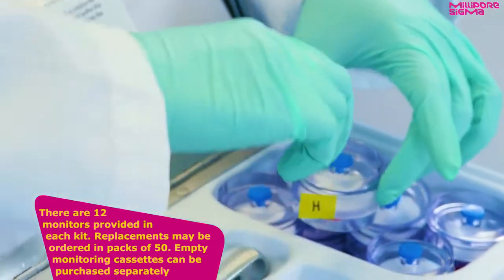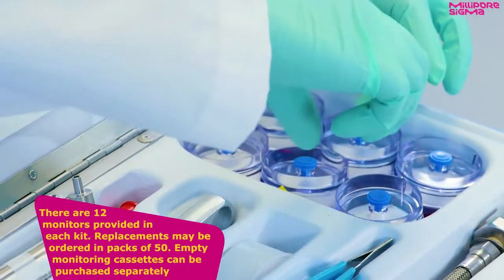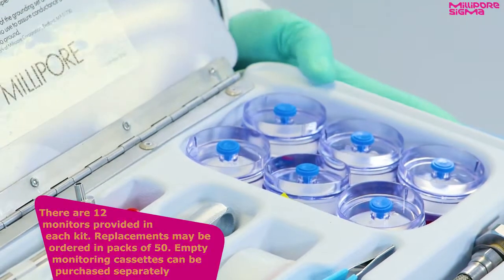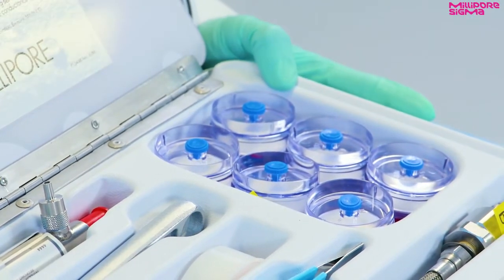Replacements may be ordered in packs of 50. Empty monitoring cassettes can be purchased separately with a variety of alternative Millipore filter membrane materials and the AP-30 support pad.